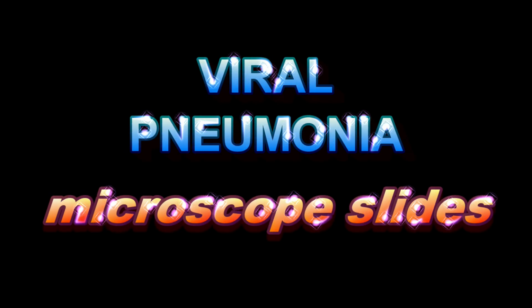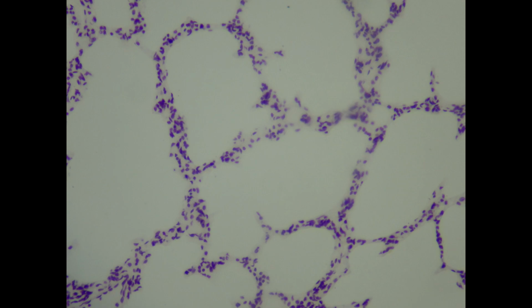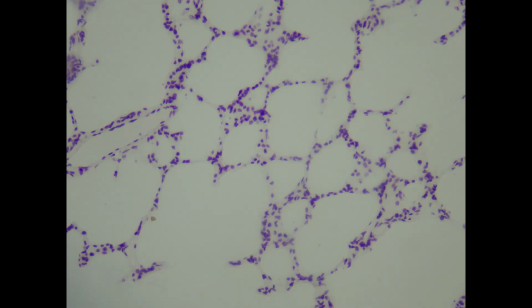These microscope images are of a healthy person's lungs. Note all of the air sacs or alveoli. The alveolus, the air sac, is the functional unit of the lung. Each lung contains about 150 million of them.